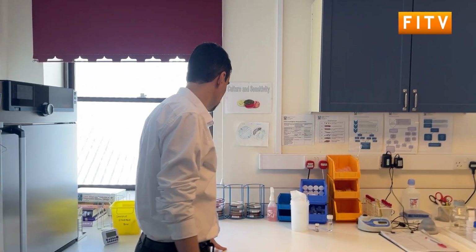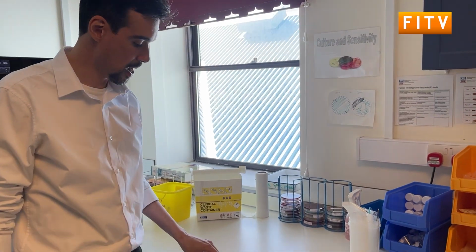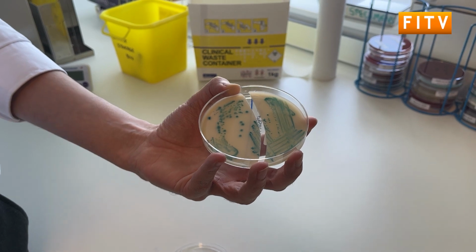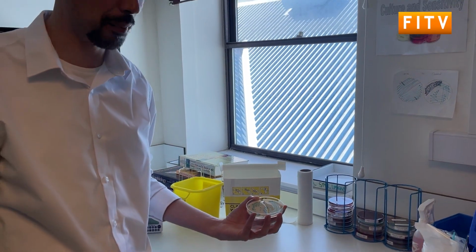Over here it is all manual methods for cultivating microbial samples in the islands. We do them on chromogenic agar for the majority of it. And this plate just allows us visually to see what type of bacteria has grown on there from the colour it has come up as.